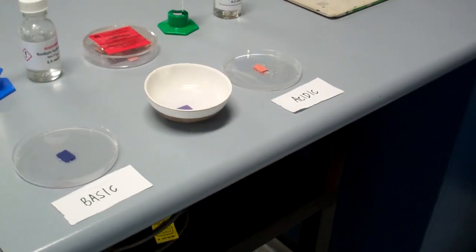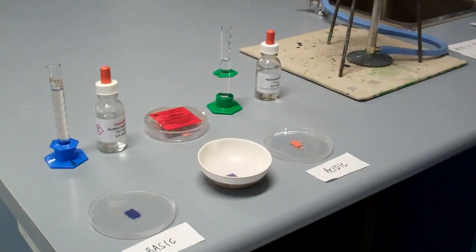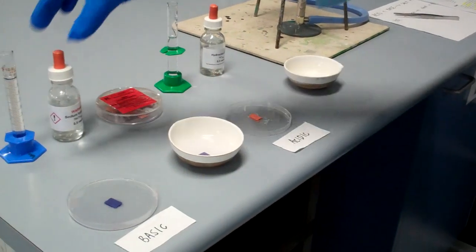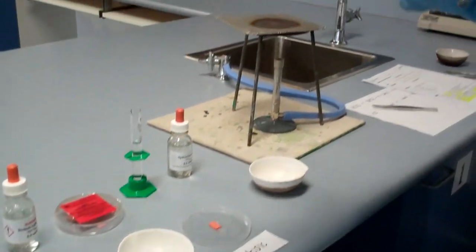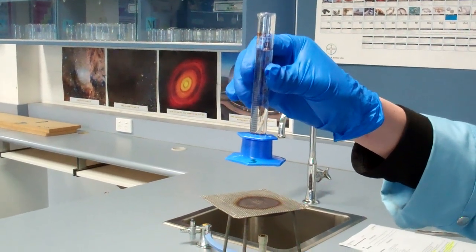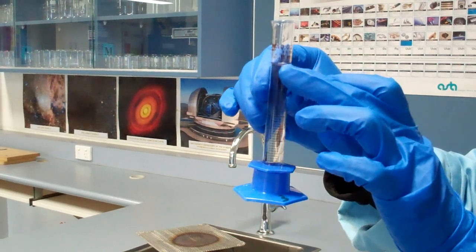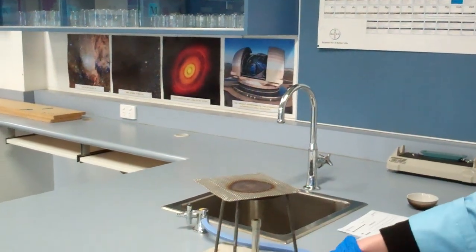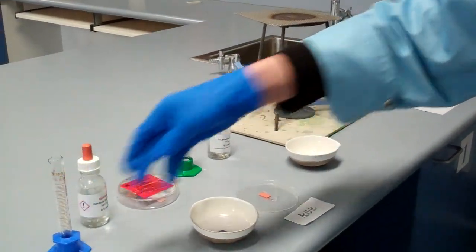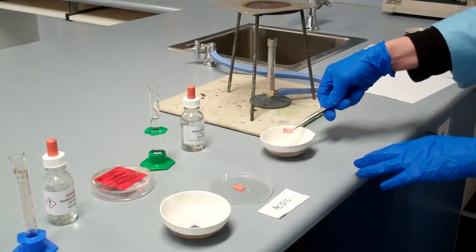So we will start with measuring 10 mL of your sodium hydroxide using a measuring cylinder. I have already poured in 10 mL of your 0.5 molar sodium hydroxide solution. Remember, you need to read the volume from the bottom of the meniscus. Then you pour it into your evaporating dish. So 10 mL in there, and then you will need to put your litmus paper. I'll take one of the litmus papers and put it in there.